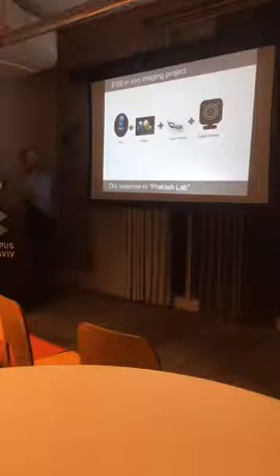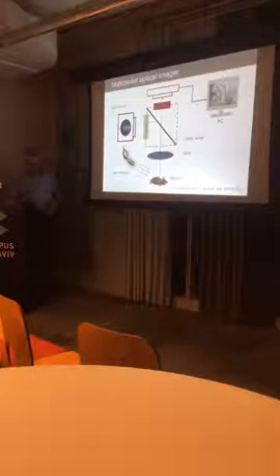Of course, we use a laser module, like here. Nothing very specific; you can buy one on eBay for $1 up to $5. No need for more. And of course, a digital camera. This also could be cheap or expensive, and we tested many cameras for that. Then we combine them together. How do we combine them? I will show you first the drawings, how it looks.